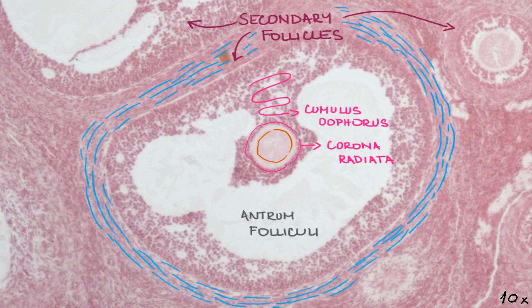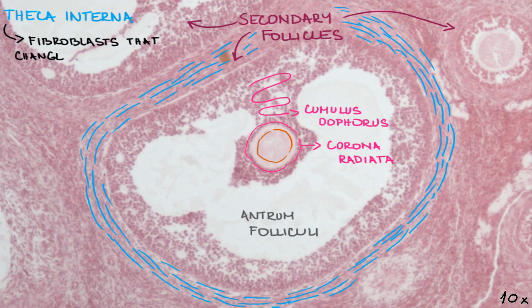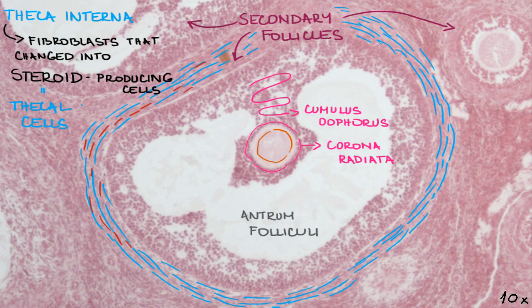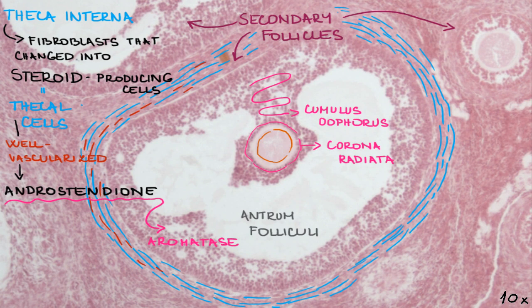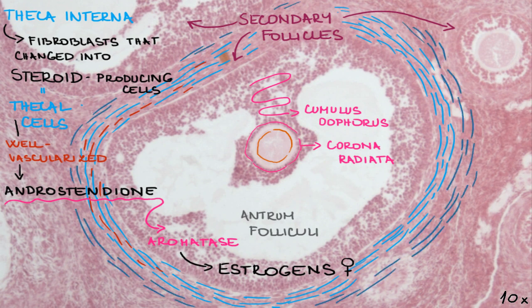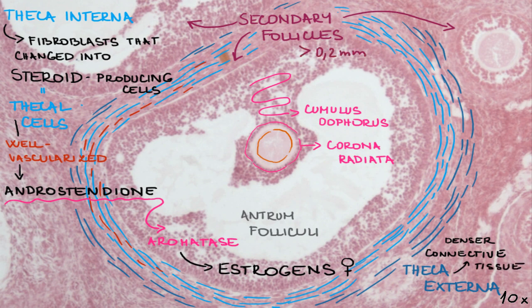Theca interna comprises fibroblasts which change in shape, forming round cells and changing their structure into steroid-producing cells; we call these changed fibroblasts thecal cells. This layer is a well-vascularized endocrine tissue. Thecal cells produce androstenedione, which then moves to the follicular cells. They have a so-called aromatase enzyme which converts androstenedione to estrogens — female sex hormones. There is one more layer around the theca interna called the theca externa, consisting of slightly denser but still loose connective tissue from the cortex. The secondary follicle has more than 0.2 millimeters in diameter and keeps growing into a mature Graafian follicle.